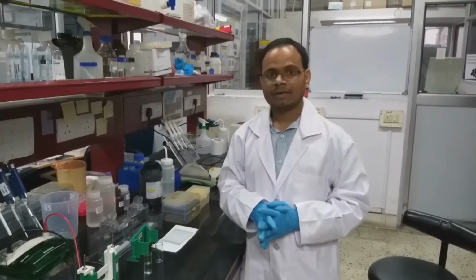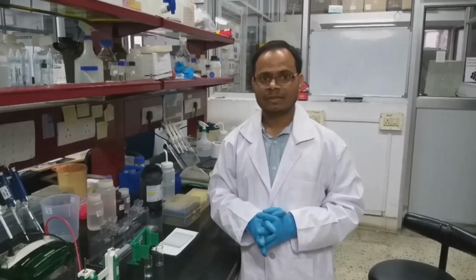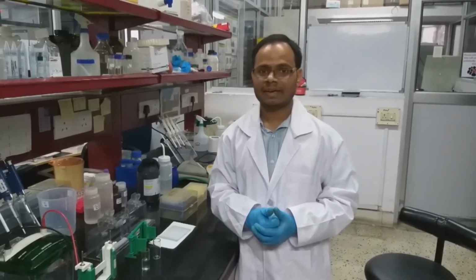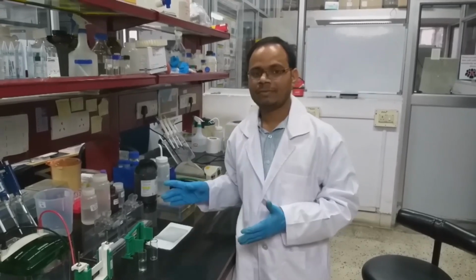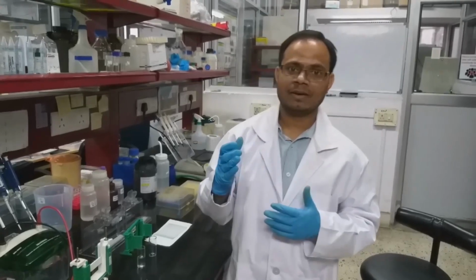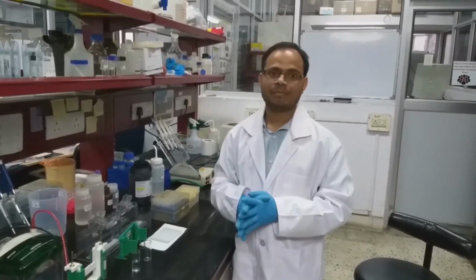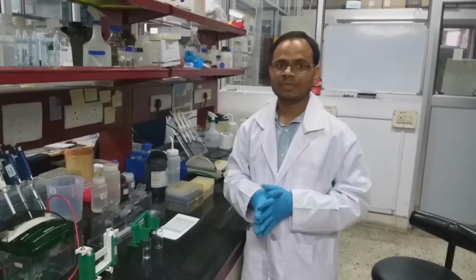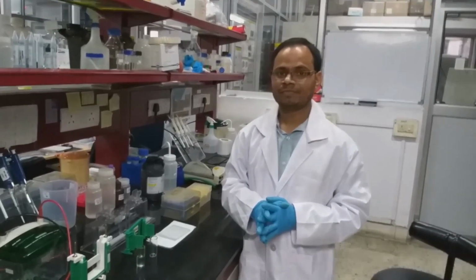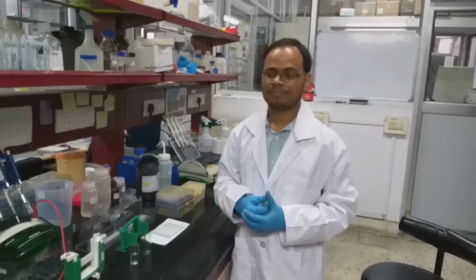The role of ammonium persulfate and TEMED we can see during preparation of gel. They act as a catalyst. After solidifying, we have to prepare stacking gel. So stacking gel is nothing but the composition is same, but we can say it is diluted. It contains pH 6.8 Tris HCl and remaining components same but in less quantities.